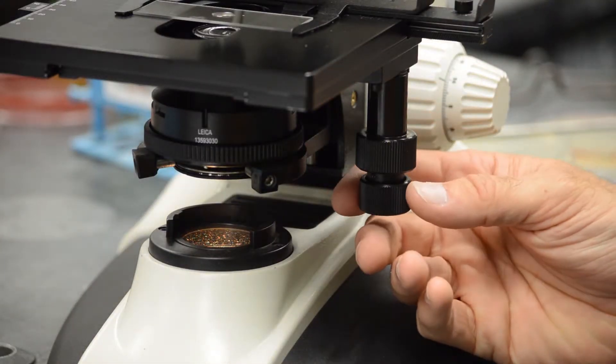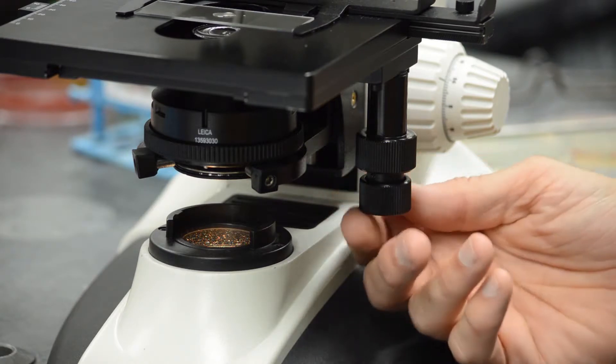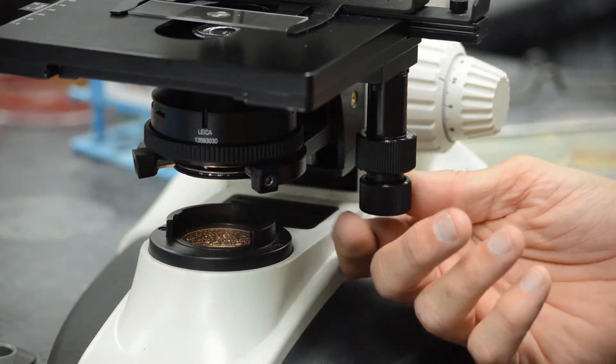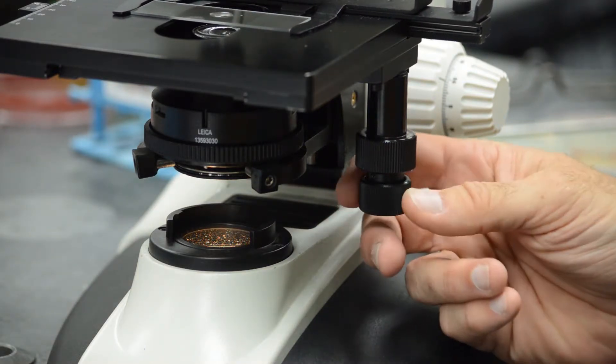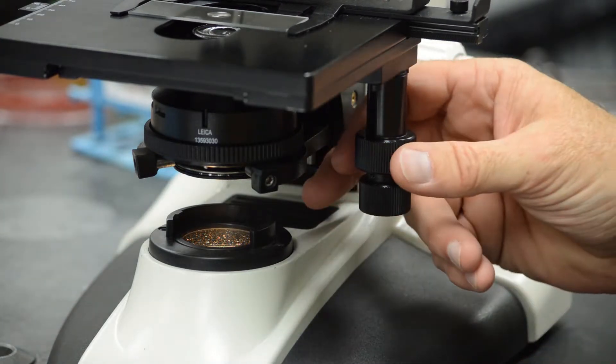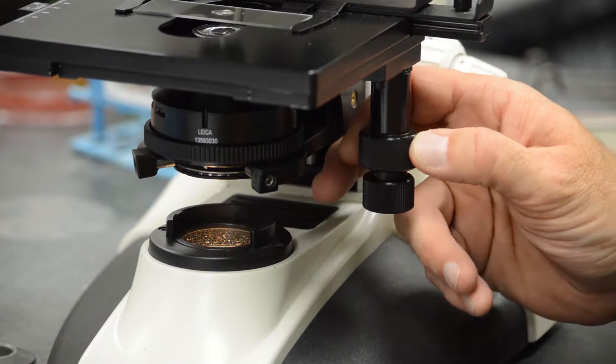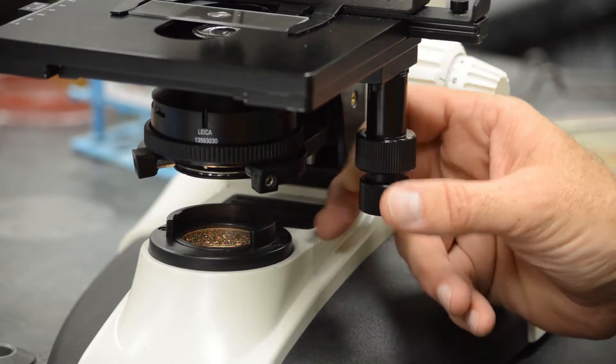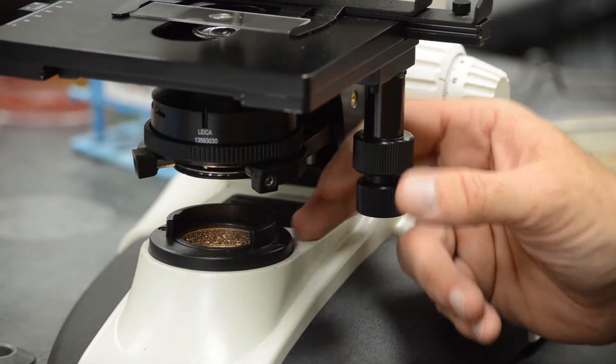In this particular microscope they are oriented up and down. On some microscopes they can be horizontal, and these two knobs control movement of the stage in the right to left and back and forth.